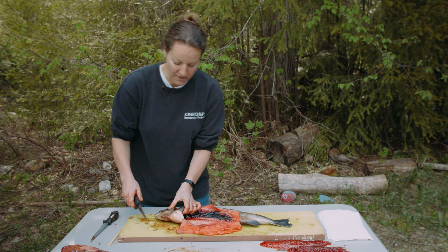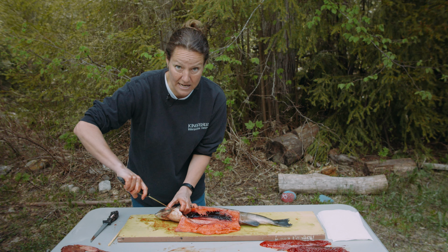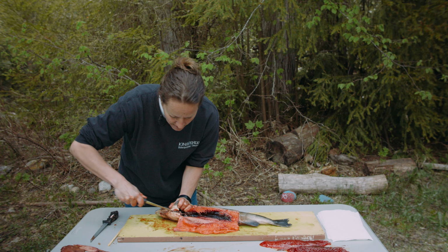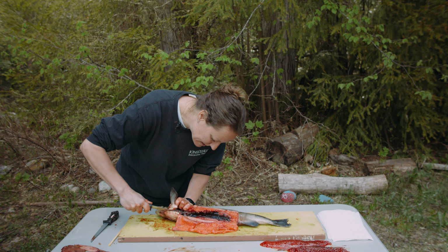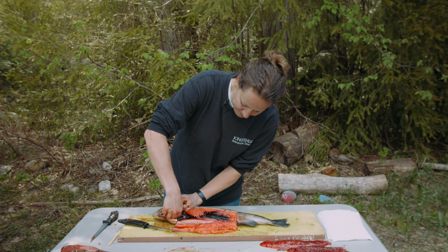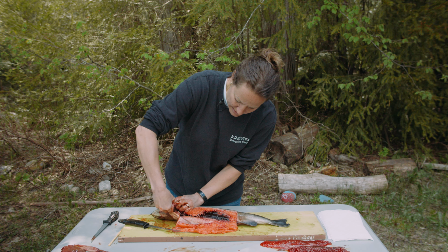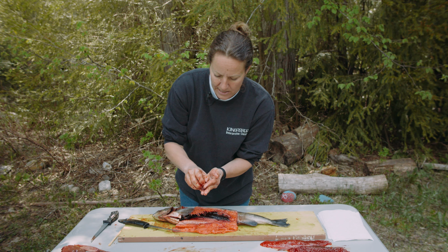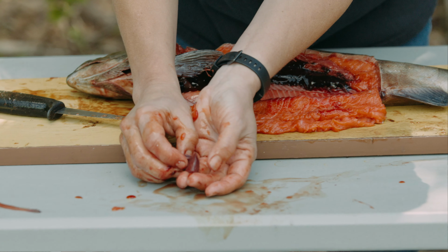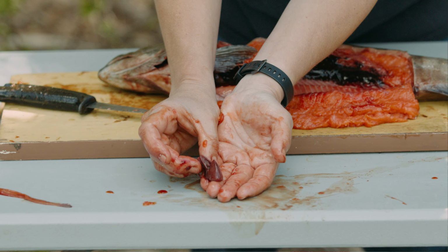And I'm going to remove it so you guys can have a look. And I'll give you a warning, boys and girls, it doesn't look anything like a Valentine. So here we go, cut into its own compartment. Oh, I think I nicked it a little when I cut in there. Here it comes. Come on, guy. Oh yeah, I did. I gave it a little bit of a slice. So there is our fish's heart. So the heart is used to pump blood through the fish's body.